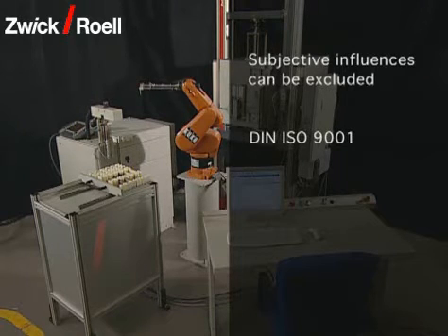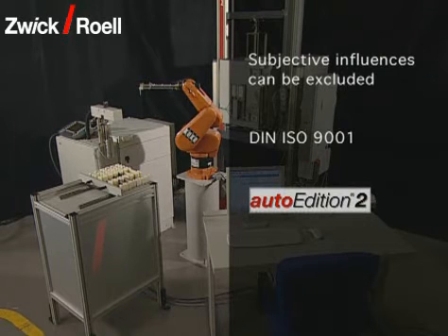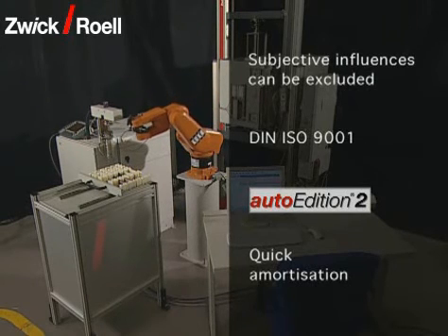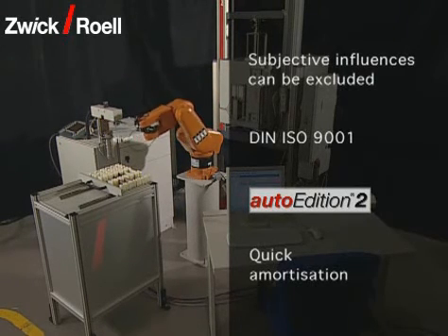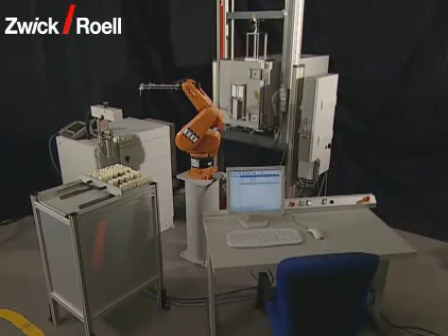The traceability of the testing conditions, according to DIN ISO 9001, is guaranteed. With the Svick software Auto Edition 2, an automation module is used which meets the most modern technical requirements. Due to the low test costs per specimen, a testing unit with automatic specimen feed pays for itself within a period of about two years.